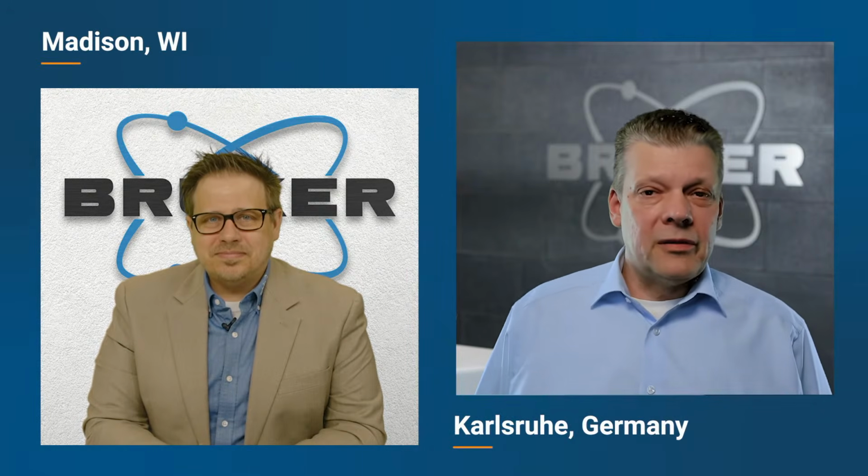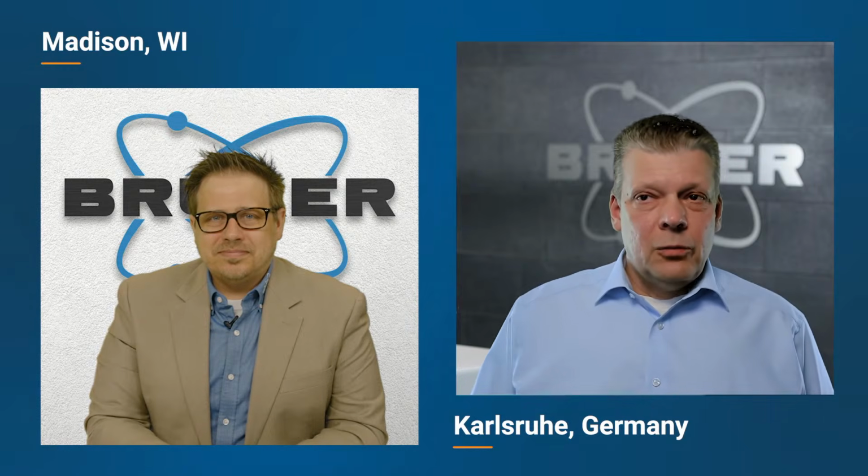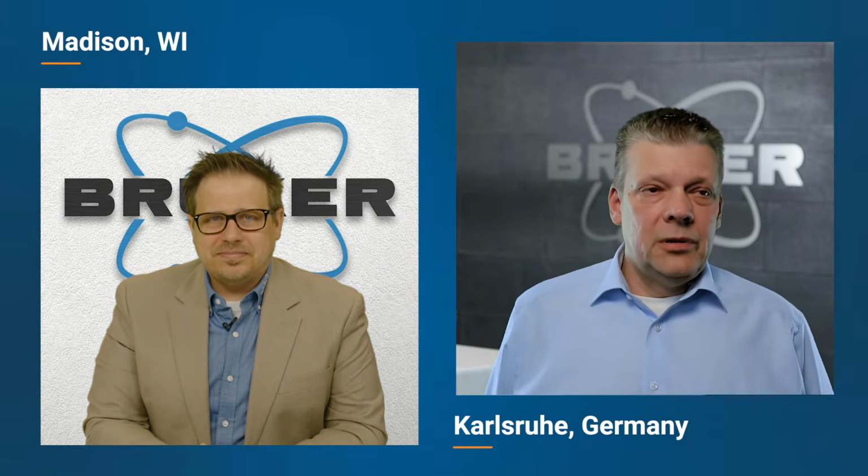Yeah, that's quite easy, because optical emission spectroscopy is also referred to as AES, atomic emission spectroscopy. So what you really do, and that's similar to what you do in ICP-OES, is you atomize a sample.